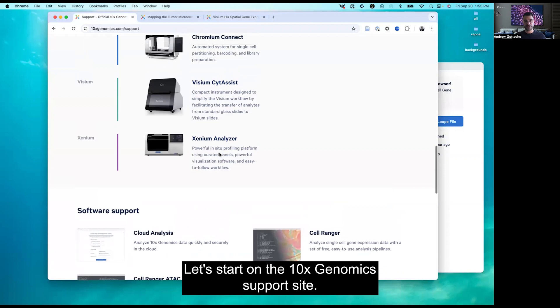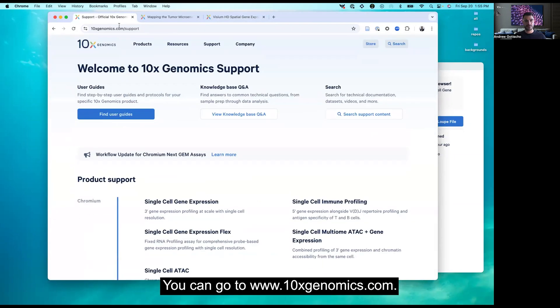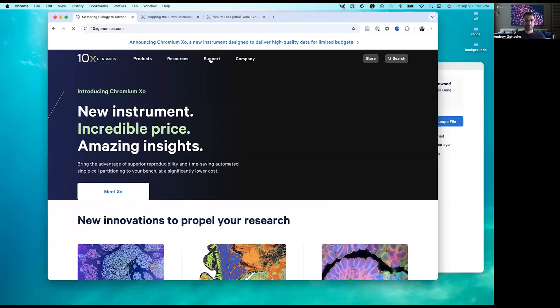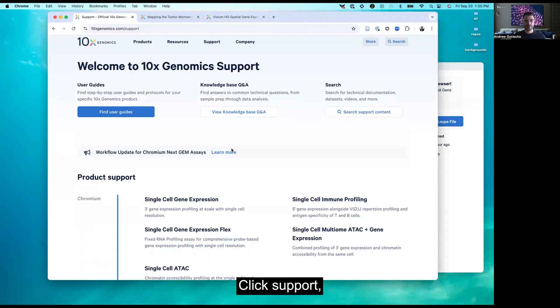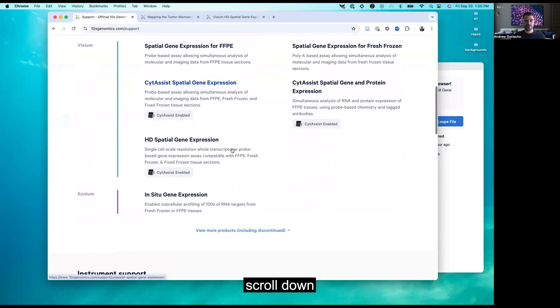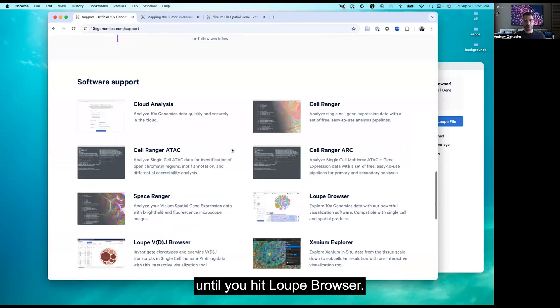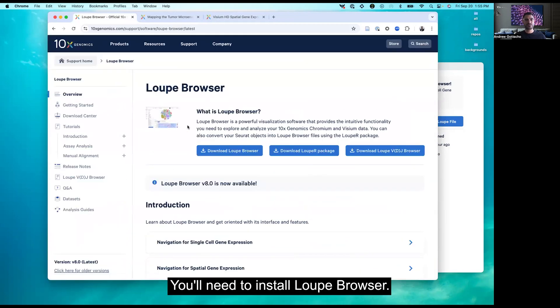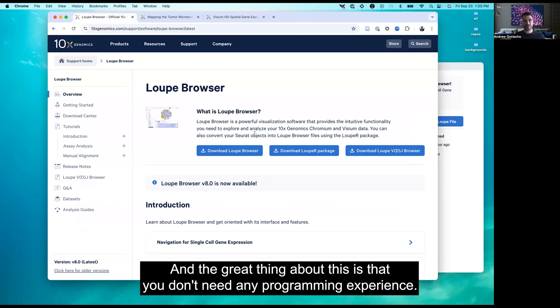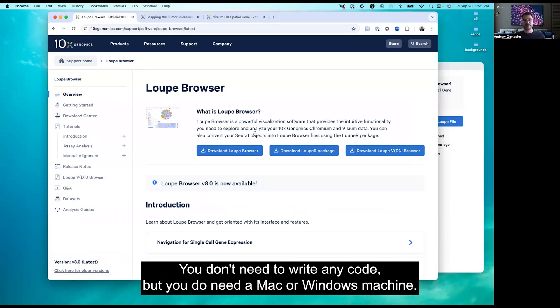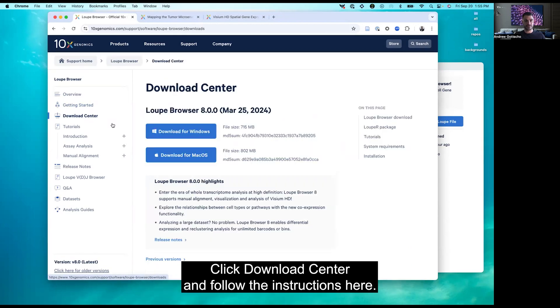Let's start on the 10x Genomics support site. Go to 10xGenomics.com, click Support, and scroll down until you hit Loupe Browser. You'll need to install Loupe Browser — the great thing is you don't need any programming experience or code, but you do need a Mac or Windows machine. Click Download Center and follow the instructions there.